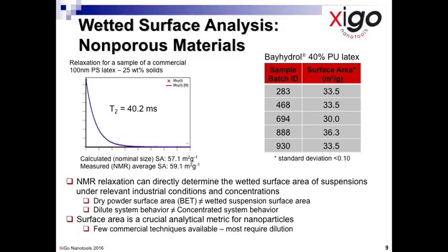Although the results are in good agreement, the lower latter value arises because the suspension is not truly monodisperse and almost certainly is not a uniform size distribution. In this case, the choice of a mean, modal or median size will result in a different calculated surface area. This issue will be examined further in a future video.